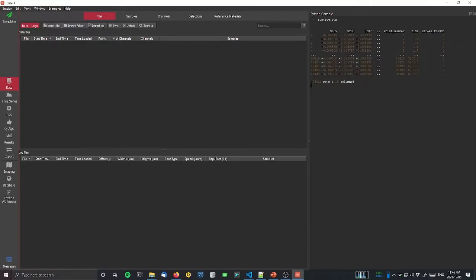Now, luckily in this file format, we have this point number column, so we can check that we haven't cut off too many lines with our skip header number of lines to cut off. So if we can see the 1, the 2 and the 3, then that means we haven't cut off too many. If it started at 2 or at 3 or whatever, it means that we'd cut off some lines at the start. And similarly at the bottom, we can check to make sure that it's reading all of our data, because it's a common error that I've found that sometimes you won't be reading all of your file, by looking at the total number of points.